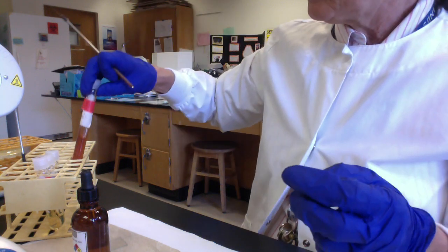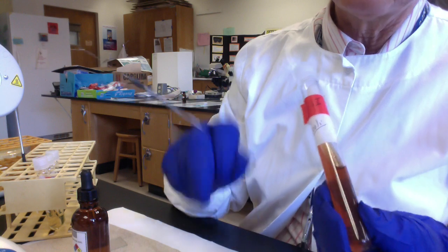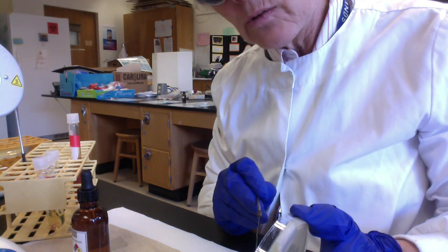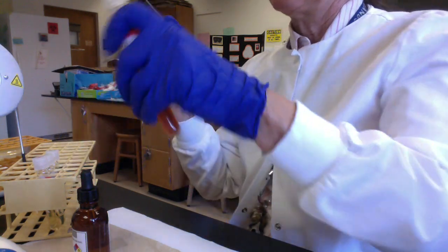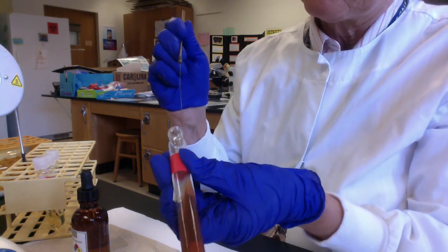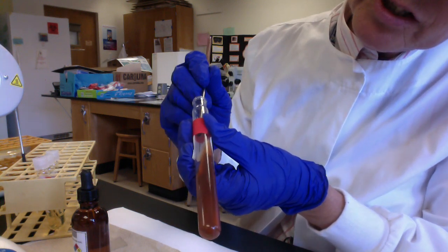So to run this test, you guys, we have to force our microbes to grow anaerobically in the butt. So we're going to use our inoculating needle, and we're going to do a stab and streak because we need our guys to grow both anaerobically and aerobically. So I'm going to harvest my E. coli. All right, and then I'm going to stab the butt. I'm going to try not to hit the bottom as I stab it, because that might provide an alternate way for oxygen to reach the microbes in the bottom.